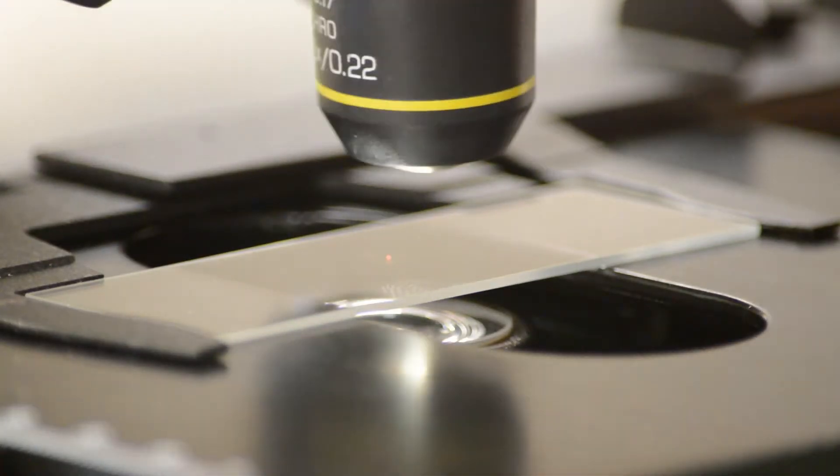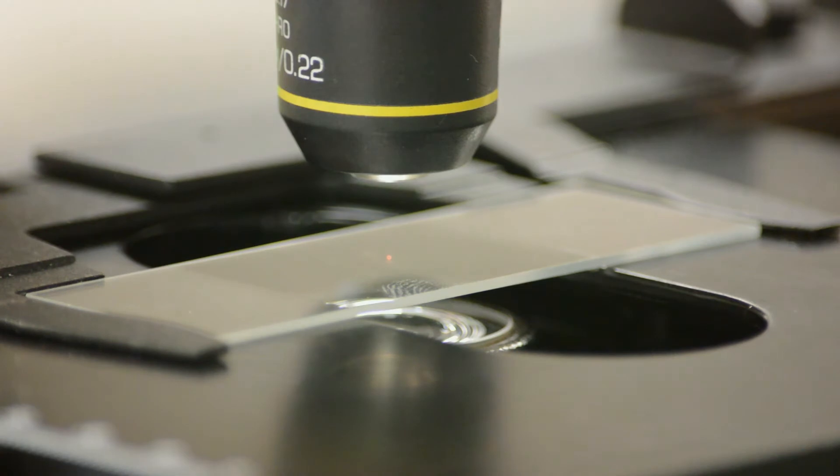We then grab the turret. We rotate the turret to bring in the next higher power objective which in this case is the 10x objective. We click it into place.